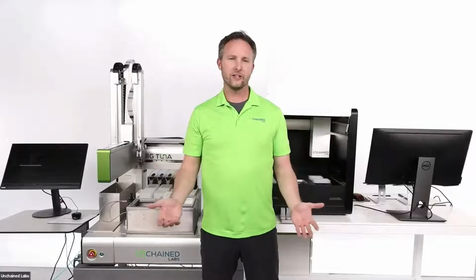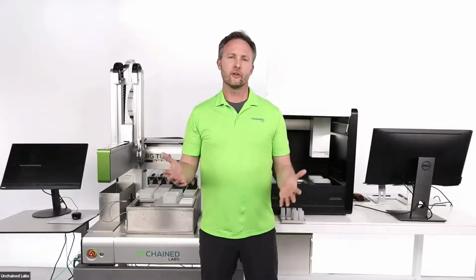And where are they different? That might be the other reason you're logging in today. You've heard of Unagi, you've heard of Big Tuna, but really, what's the difference between them? That's something we're going to get into right now. We're going to discuss the consumable, look at the hardware a little bit, jump over to my favorite, the software, and then finally see both of these instruments in action.